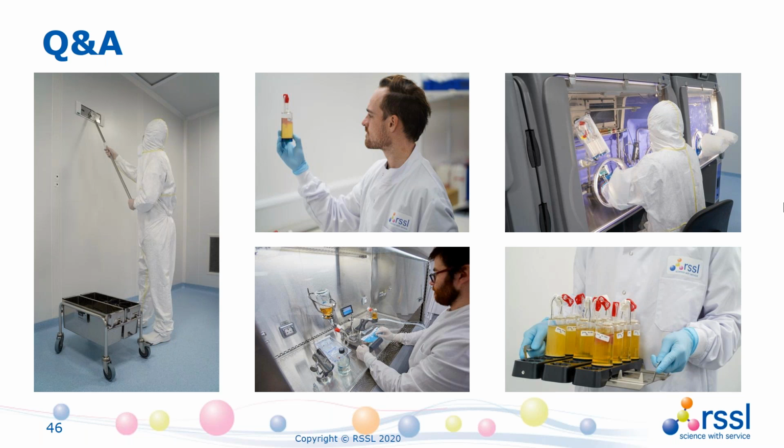The key thing is to ensure that, sometimes they can be so small that you do then need to add them to an isotonic solution. If you're going to add them to a solution to create the bigger volume, you need to make sure that you've then got a homogeneous solution. So the degree to how much you might be mixing that is important, and then ensuring that there is even distribution between the two chambers that form the membrane filtration test. So yeah, it's perfectly permissible, but you've also got certain variables that you need to control more fully.